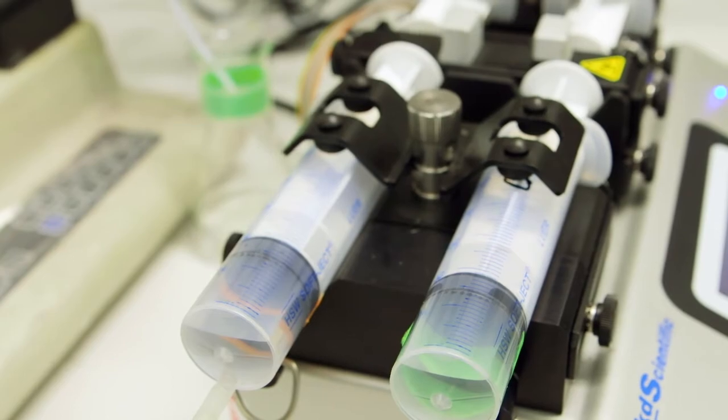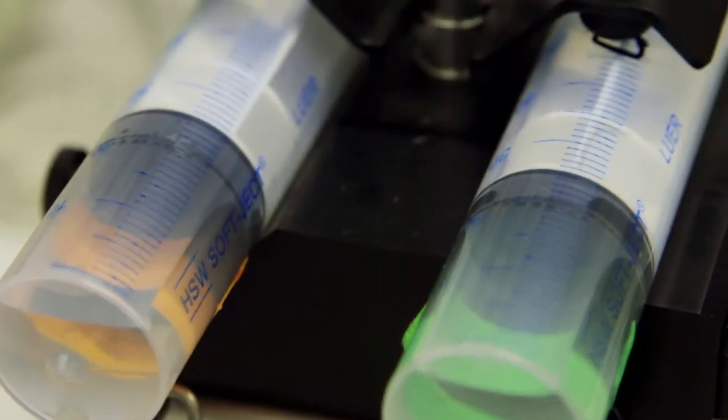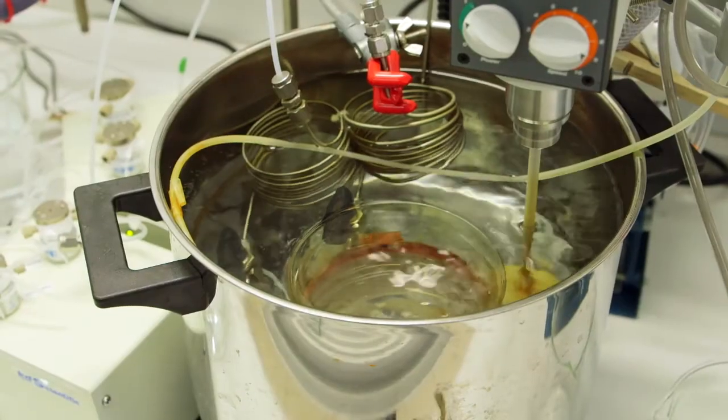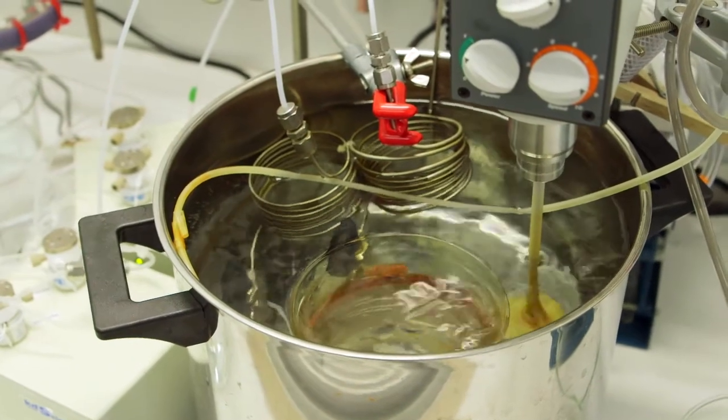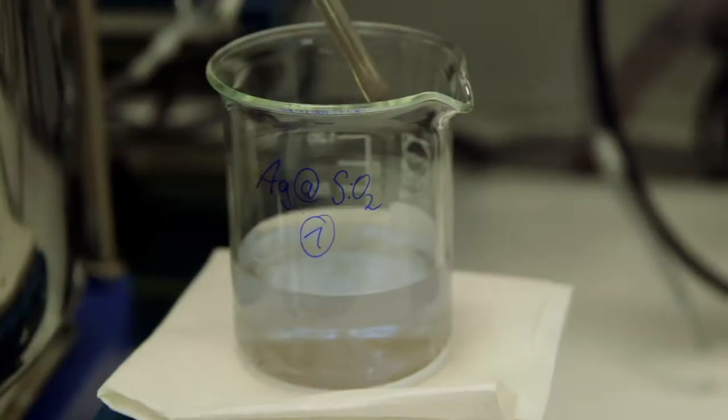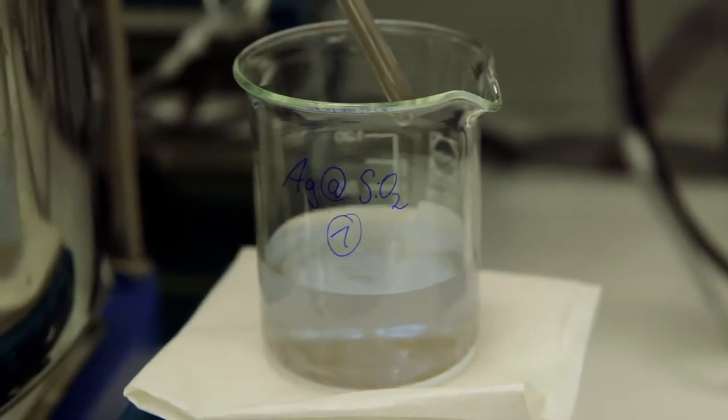Since it is difficult to produce such core-shell particles using batch reactors at large scale, we have developed continuous processes like this reactor here. This brings the advantage that we can use in-line optical spectroscopy to measure the particle optical properties as they are produced.